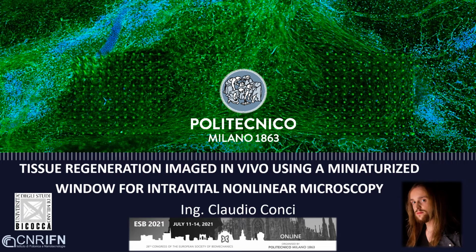Good morning all, I'm Conci, biomedical engineer from Politecnico di Milano, and today I'm going to talk about tissue regeneration imaged in vivo using a miniaturized window for intravital nonlinear microscopy.